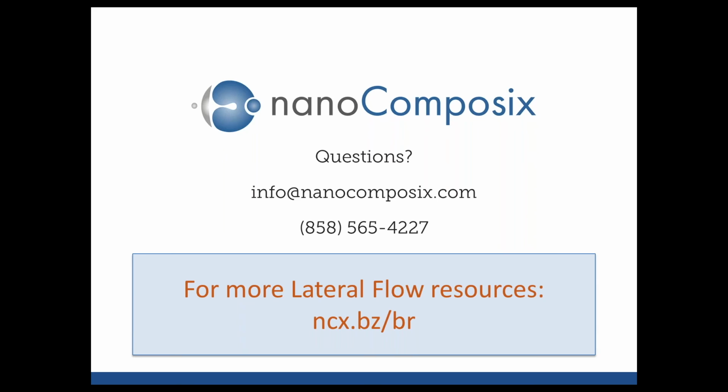If some of the conditions we mentioned, like harsh extraction buffers or high salinity samples, are used in your assay, it may not be an option to use passive adsorption. In that case, if you had an antibody that wasn't working well with covalent attachment, it may be worth looking into other antibodies.